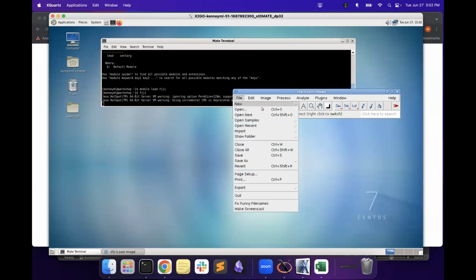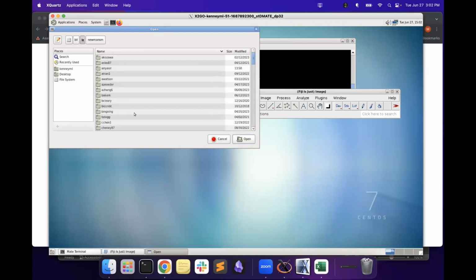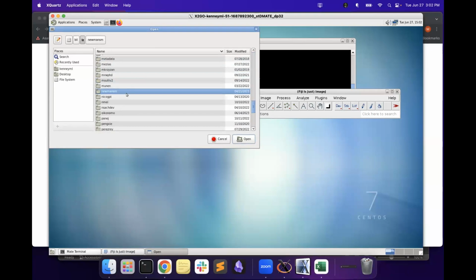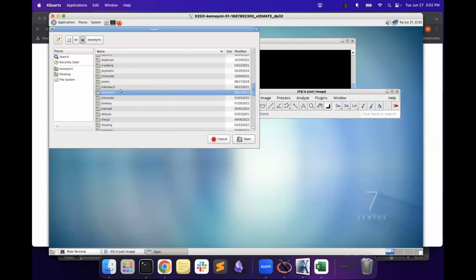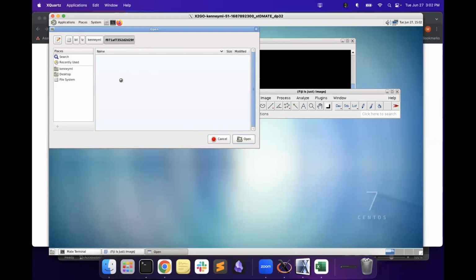So if I've opened Fiji and I want to take a quick look at what I've got going on in the landing zone, I'm at the BIL landing zone, and then I can go to my directory here. I don't think I have any files, and I don't want to look at anyone else's stuff, but it's just as easy as clicking and pointing at what file you want to open and just visualizing like that. So just to give you an idea of what is available.